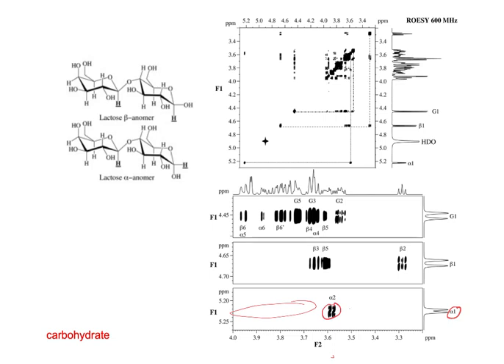I guess what you can see is you can actually see a COSY. So this alpha 1 to alpha 2 isn't really an NOE, but it's a J or scalar coupling. All right? And the reason is because this is equatorial, it's not close to any of the other protons, and it just shows the coupling to here.